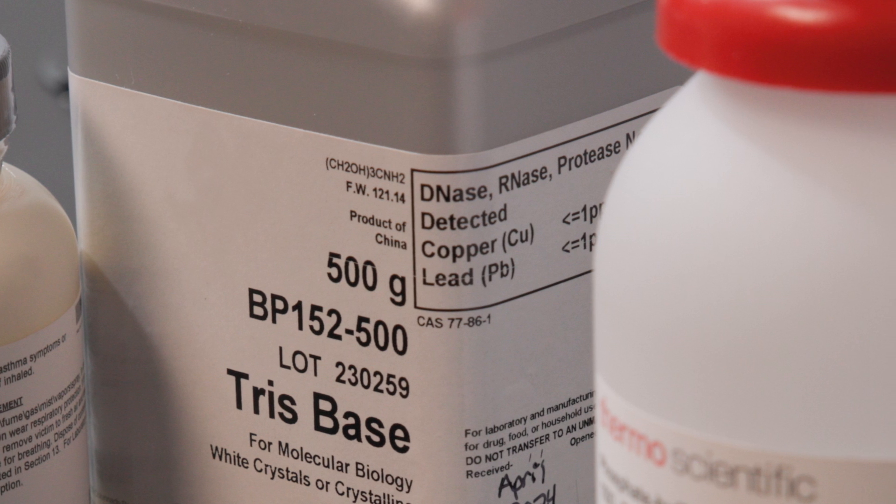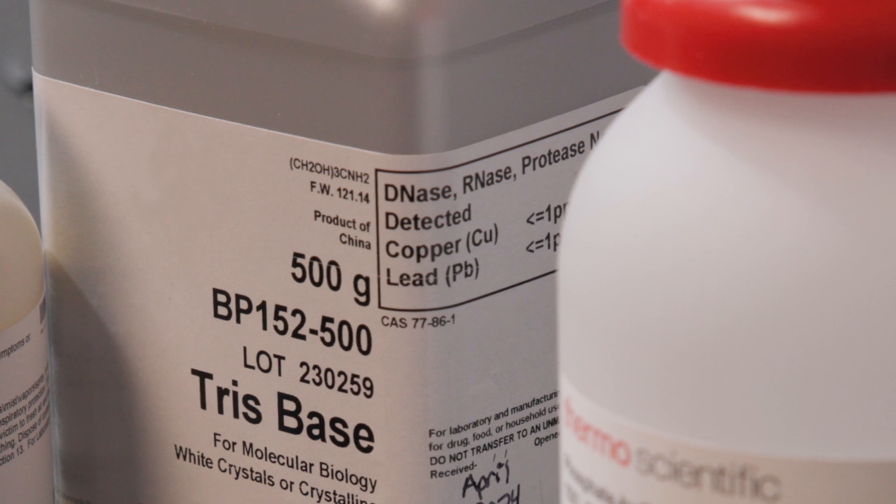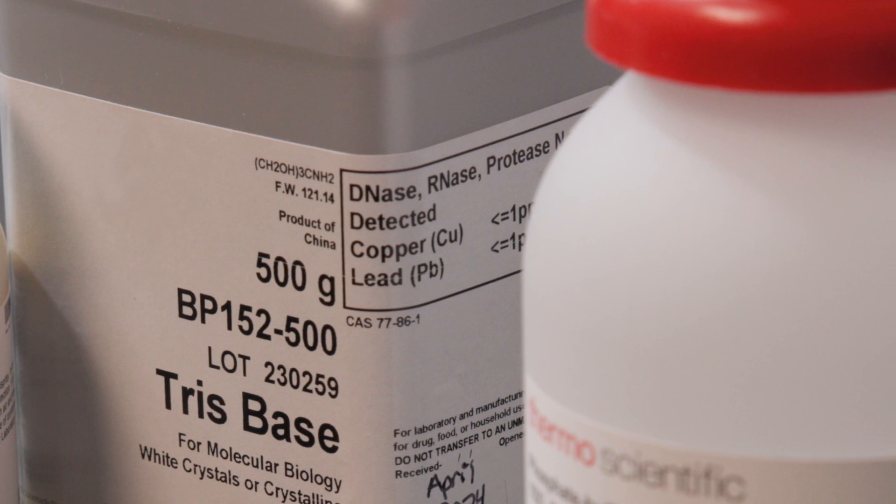To find one that's appropriate, you must first understand your sample. Many modern pH electrodes contain silver ions as part of their reference system. But some samples — such as proteins, tris buffer, enzymes, and sulfide — may react with silver. These reactions can compromise your sample and cause the electrode to malfunction.